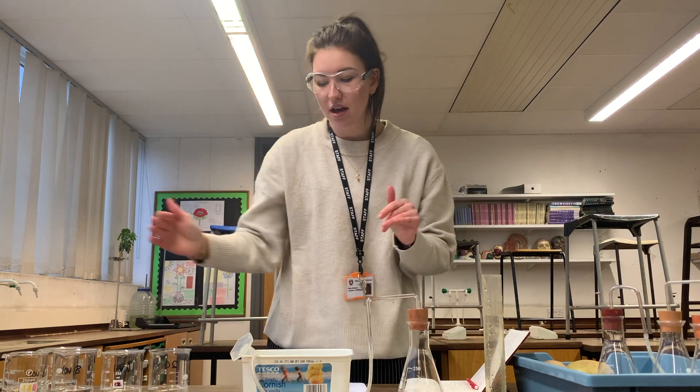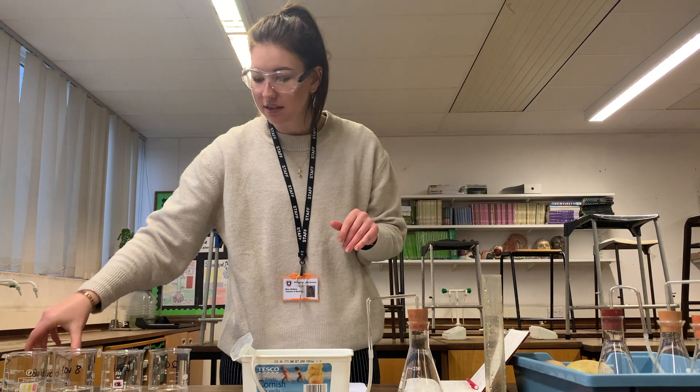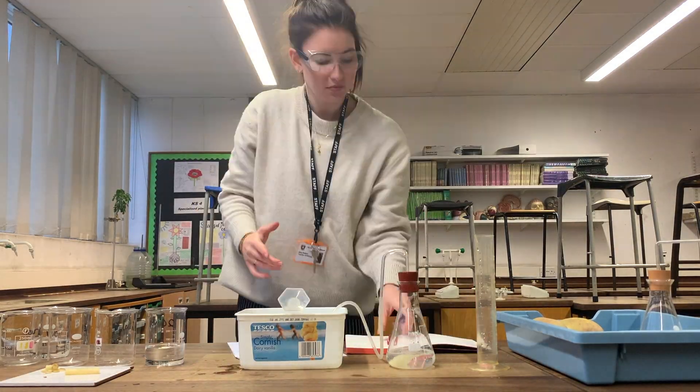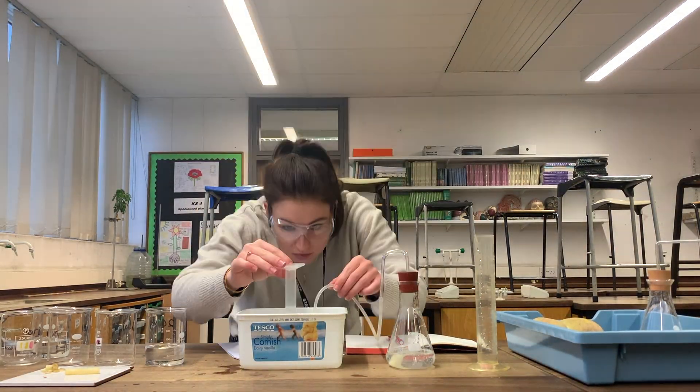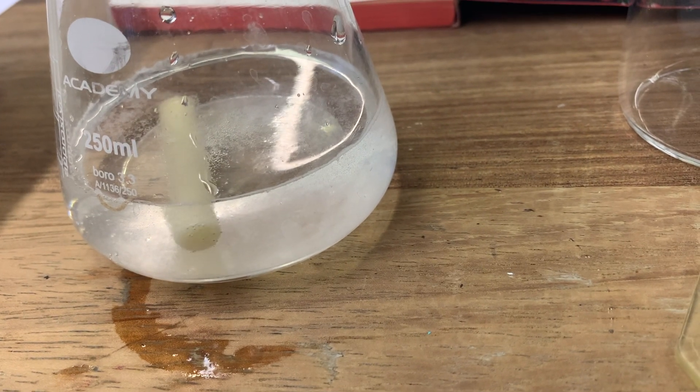We're going to work up the concentration — we started with our 2 vol, so next is going to be our 4 vol. This is our last one — it's really fizzy, the potato is actually moving around at the bottom, there's so much oxygen.